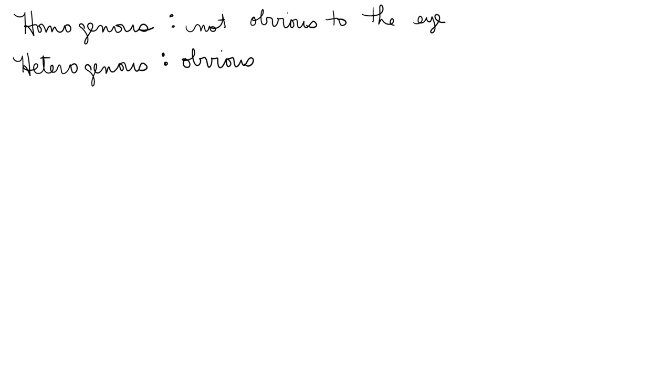Another thing that I want to discuss, which is very frequently confused, is the difference between extraction and decantation. Extraction is a really precise term, and it is frequently only used when you are separating two liquids from each other.